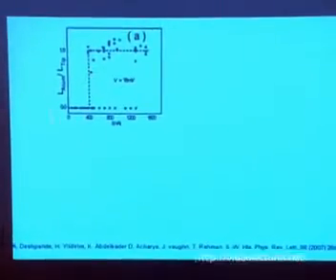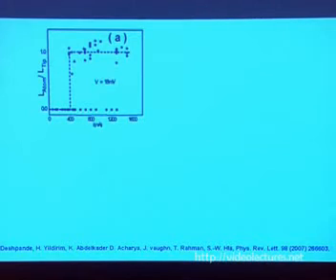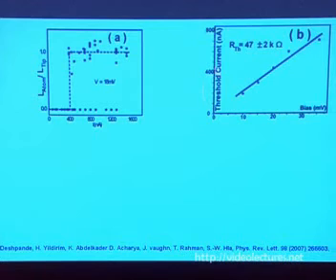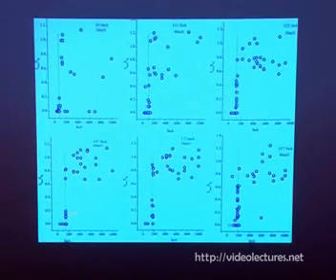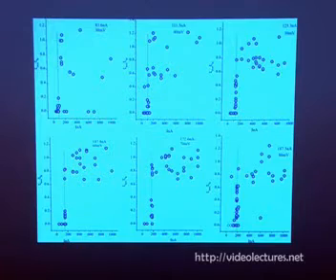So here is the probability of atom extraction, and this is the current. By changing the current in STM, we can change the height. As you see here, at low current, that means a faraway tip, atoms cannot be pulled out. At a certain current, the atoms start to come out, so the probability becomes 1. Now, if we change the voltage, at different voltages we have different sets of currents. I will just quickly show the next slides. So this is how we measure. We have different voltages, and we have a shift of the current. We call these different threshold currents.